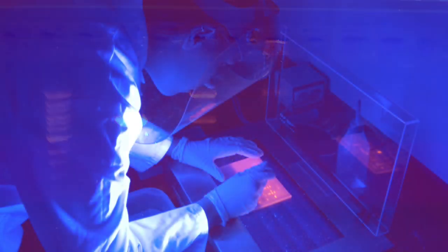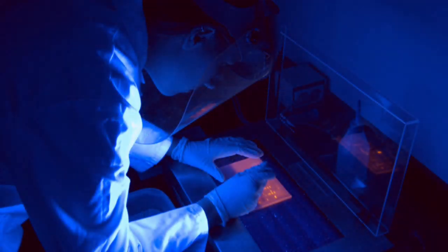In order to isolate and purify a DNA band of choice, one needs to cut the gel. This process is time-consuming and messy.